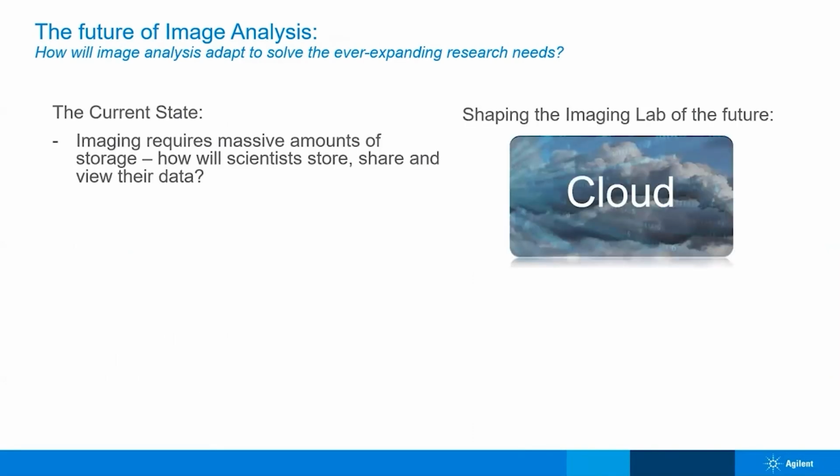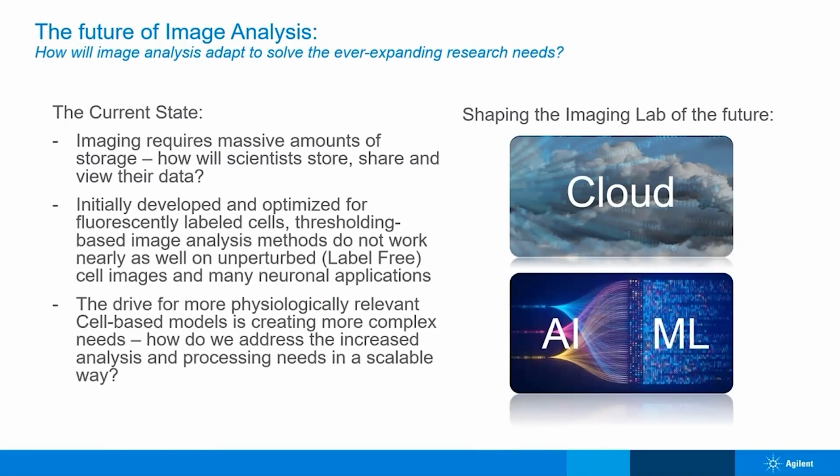Imaging often deals with massive amounts of data storage and also requires a good bit of processing power. Cloud solutions will become more and more critical for companies in this space to address current and future needs. A second area of need is around new tools for image analysis.